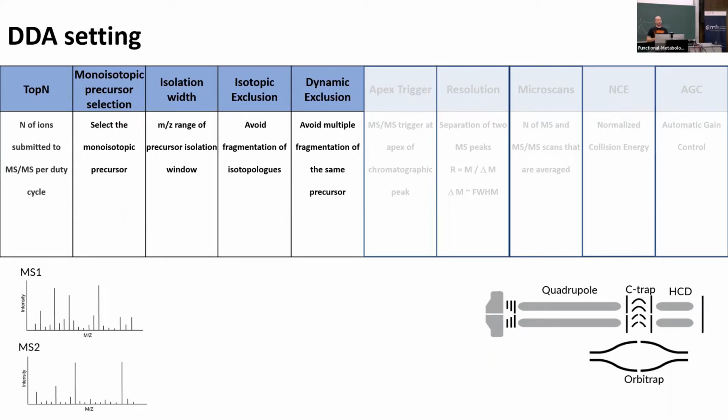That's the duration for how long you want to maintain an ion in that exclusion list, right? With the Q-Exactive, it's very simple. There's not much you can do, but with older instruments, you can also set a repeat count. That's the number of how many times you want it to be triggered before it actually is put on the exclusion list. So it depends on the instrument platform.